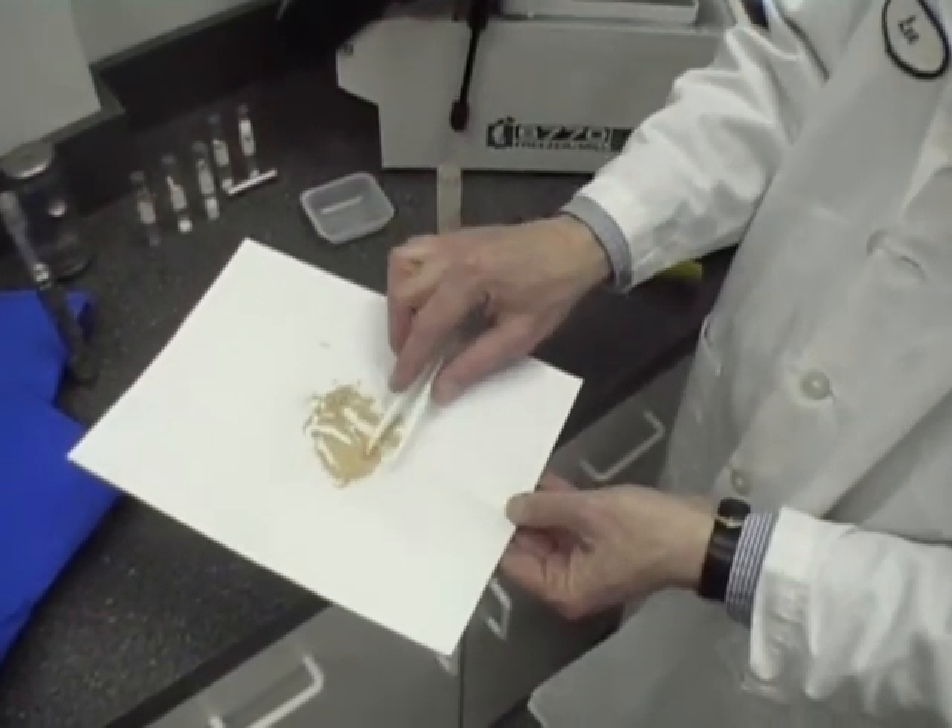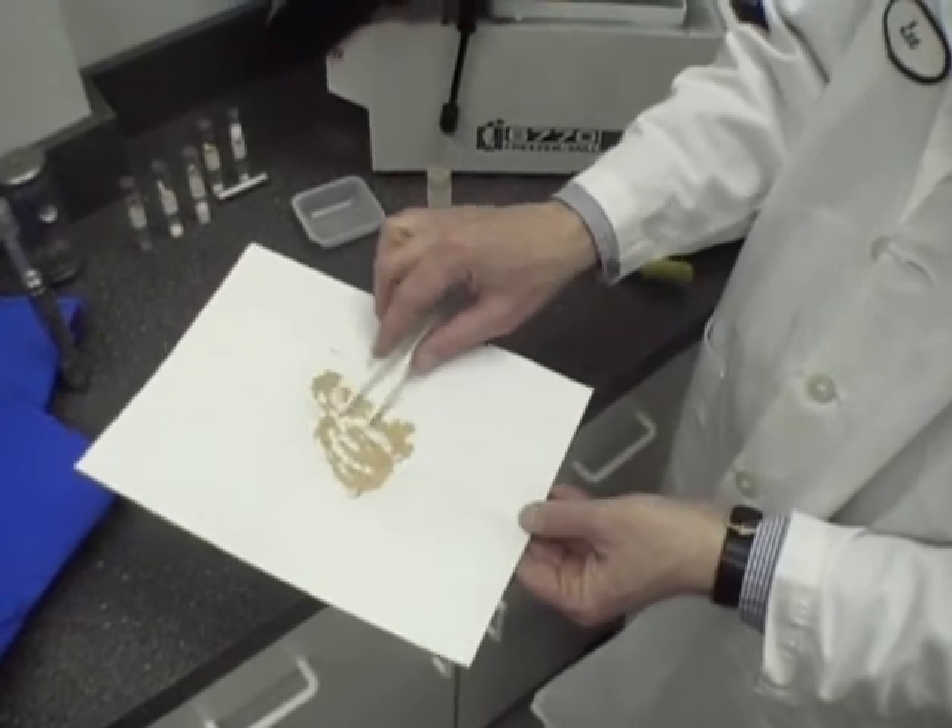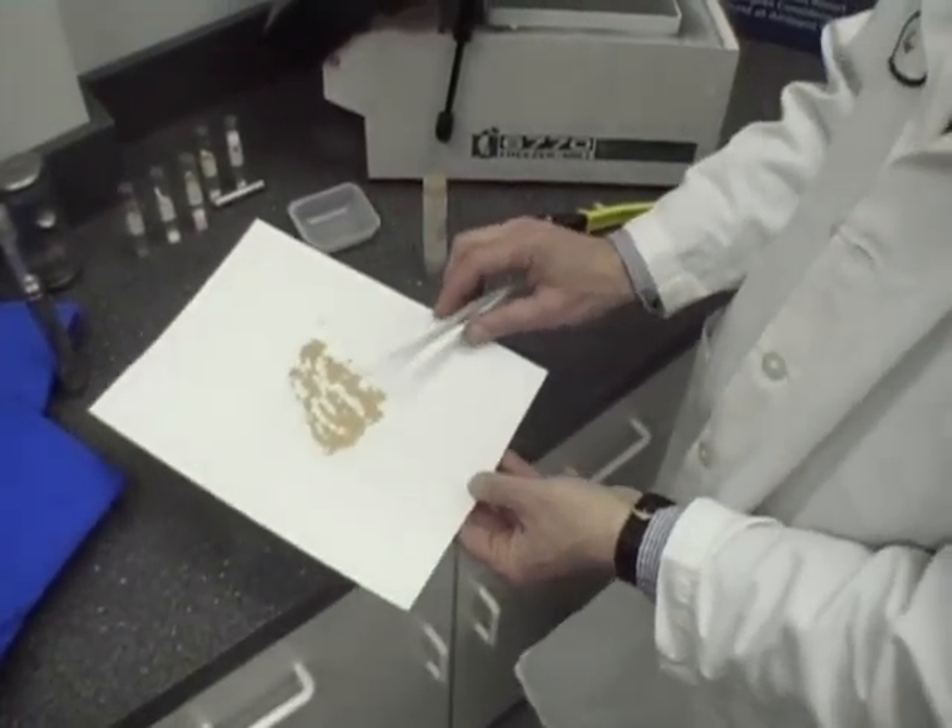The result is a powder — a talcum powder almost. Leather was a very difficult sample to grind at room temperature, yet it has been reduced to a very fine powder.